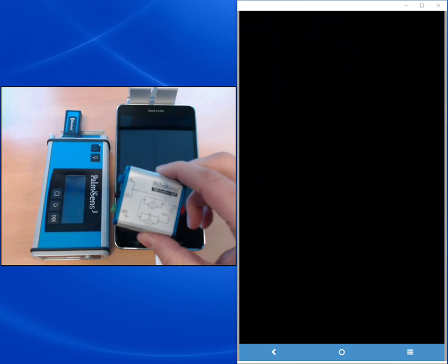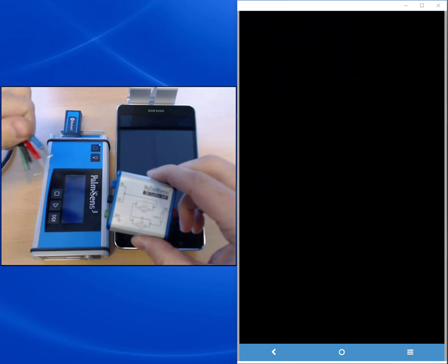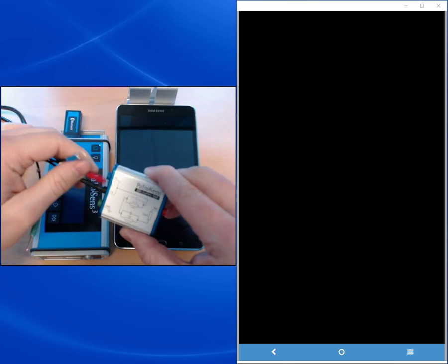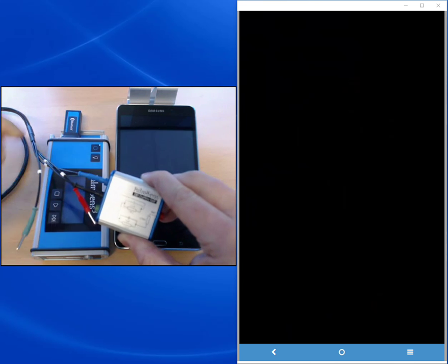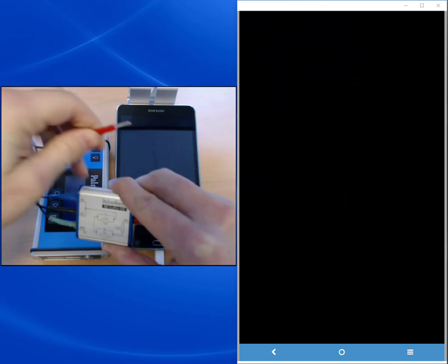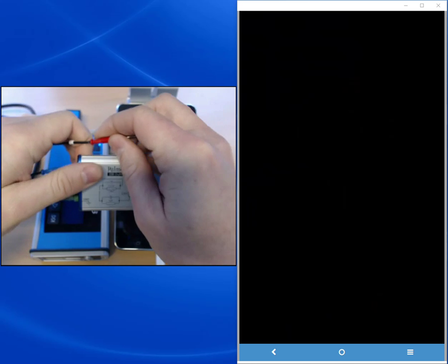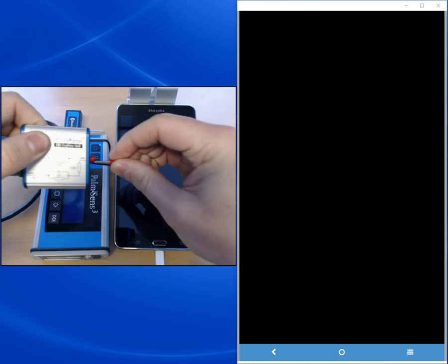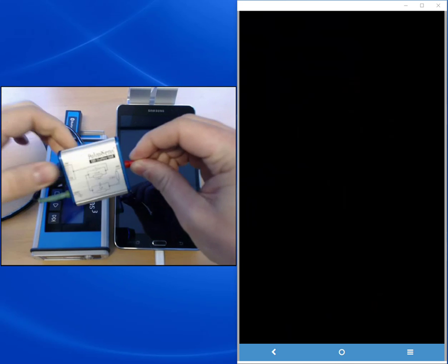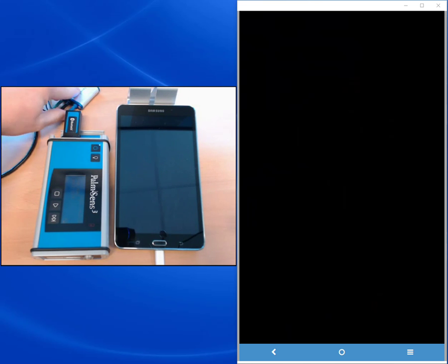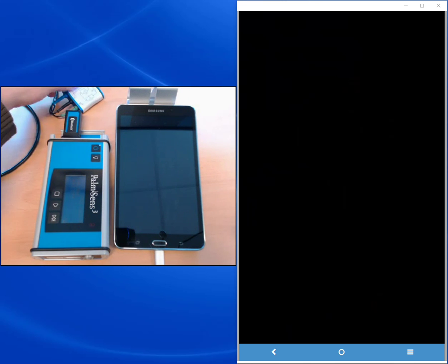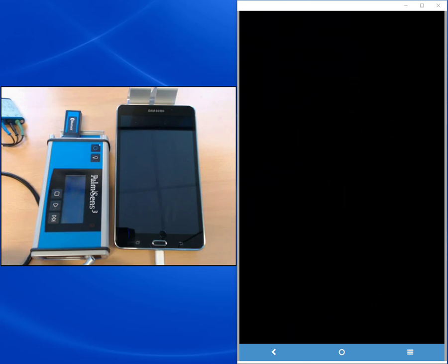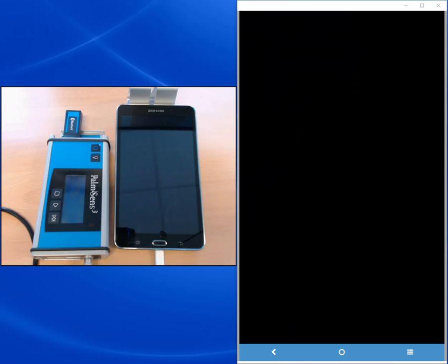So I'm connecting this cell to the banana plugs of the sensor cable. And the limo plug of the sensor cable is then connected to the Palmsense 3. Now we're ready to start.